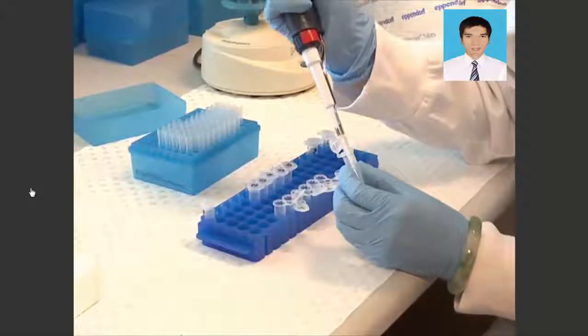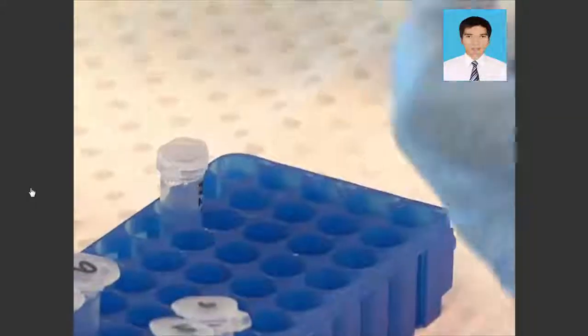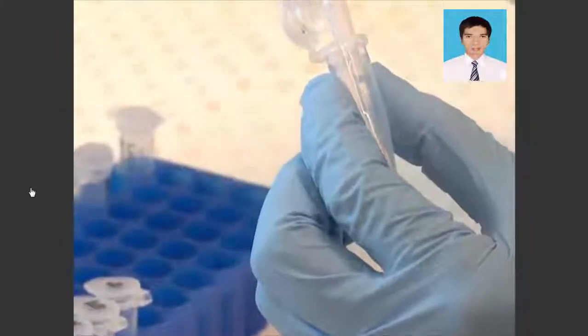To prepare DNA samples for bisulfite conversion, first incubate 2 micrograms of genomic DNA with bisulfite DNA lysis buffer in a total volume of 18 microliters for 1 hour at 37 degrees Celsius.